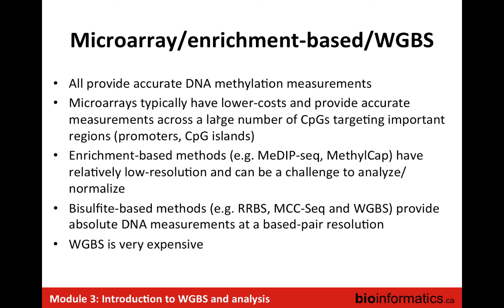It's much better then, but it's also challenging to use sequence-based data, because at least there you have the information on the reads directly, on potentially these alternative alleles, so you can do a lot more, but the bioinformatics ends up being quite challenging as well. Definitely it's much more powerful if you're interested in variants and methylation combined, so the sequence-based assays are typically better. But for that, you do need base pair resolution. So you would need either an enrichment-based approach such that you have sufficient coverage, or go for really 30x whole genome bisulfite sequencing, because if you have shallow read coverage, you won't be able to look at these.